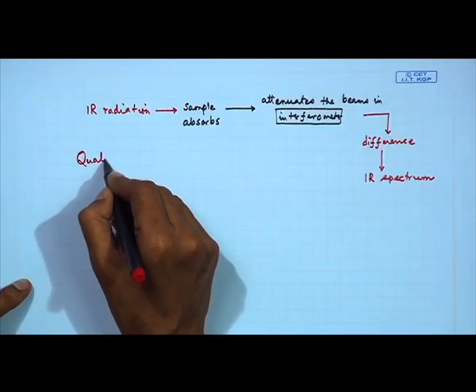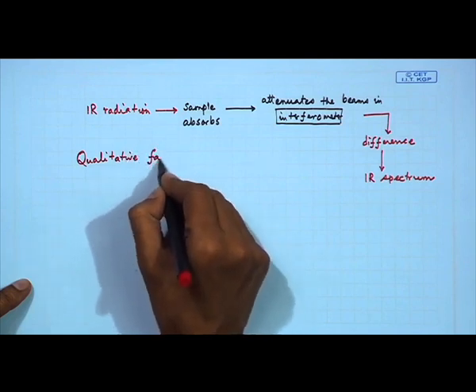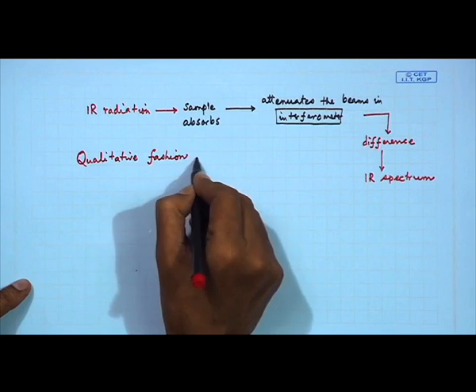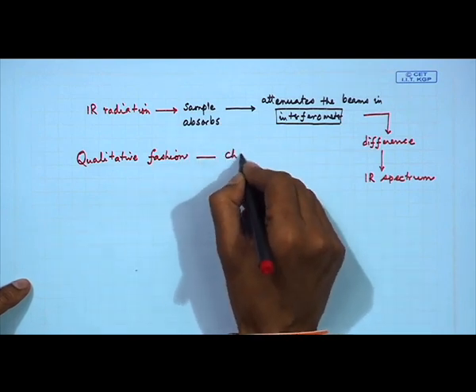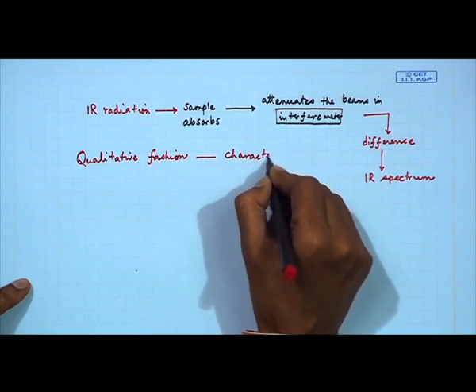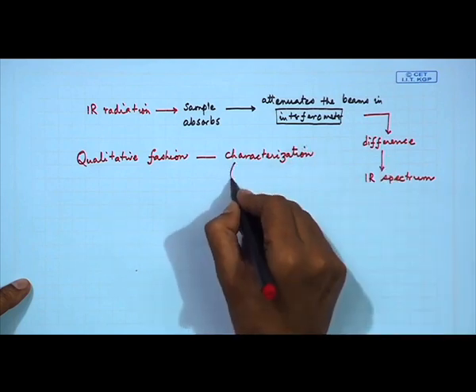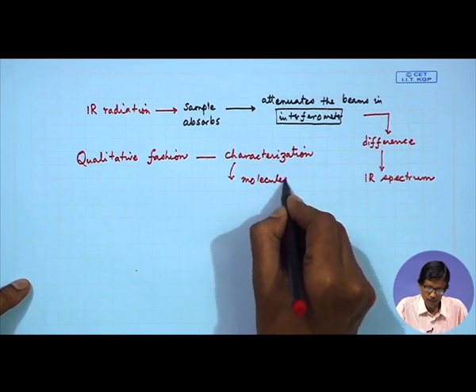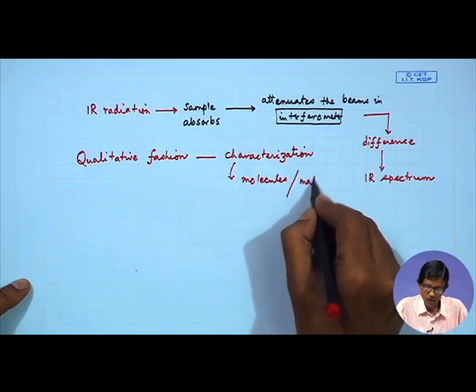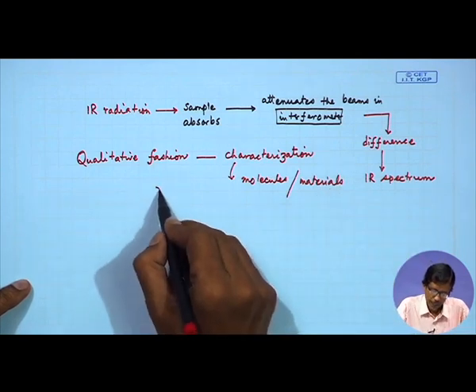So, in a qualitative fashion, we use this for typical characterization of some molecules or materials having very characteristic stretching frequencies.